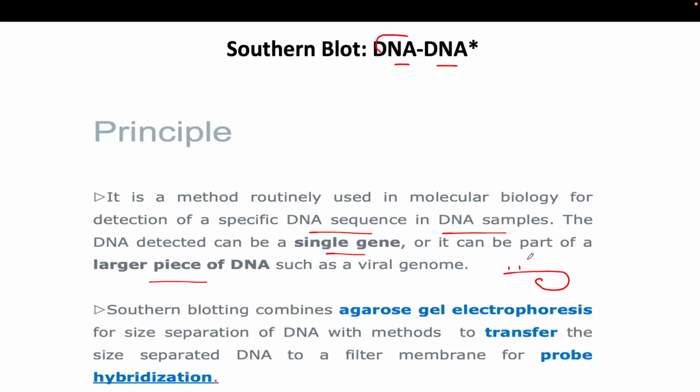In southern blotting and northern blotting, the radiography technique is generally used, because the sensitivity of radiography is very high in comparison to fluorescence and chemiluminescence. But radiography is very carcinogenic to health, so we have to do the experiment very carefully.